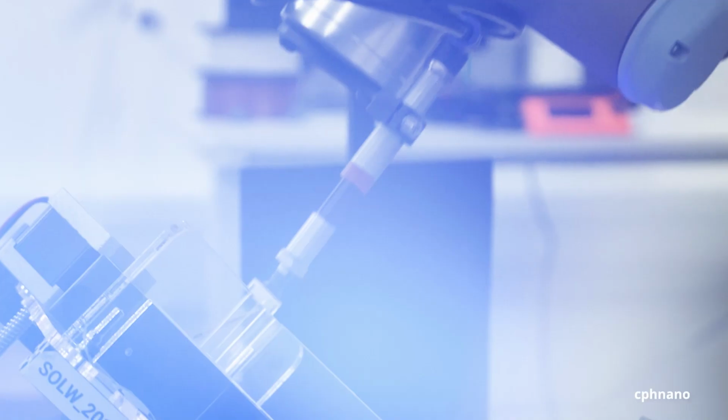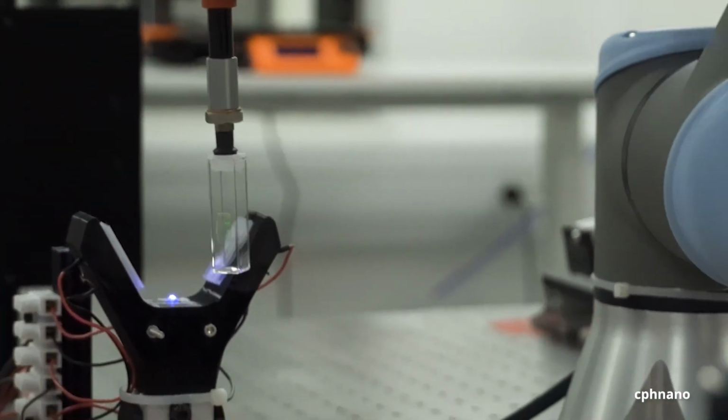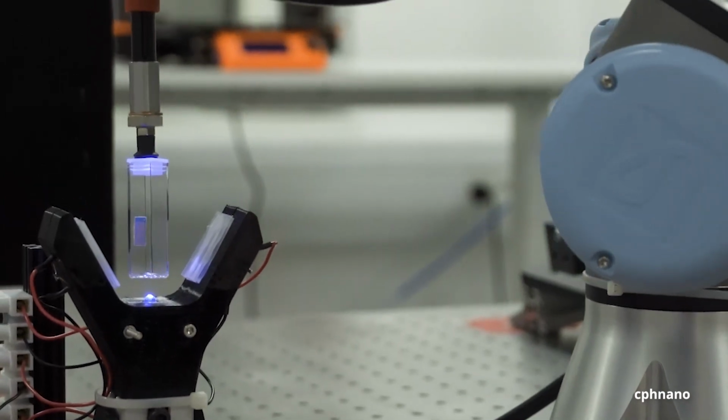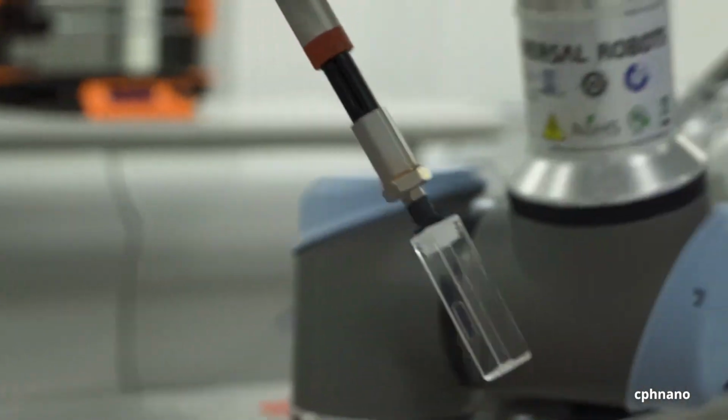One of the first instruments that you're helping to transform and bring into the digital world is the spectrophotometer, because there's over 1 million of them deployed globally. How does the platform for cphnano bring the spectrophotometer into the digital age? Normally when you have a spectrophotometer, you are measuring the intensity of light and how that is lost over the duration of the sample. So you put your light through the sample, and then you measure the intensity loss. And this is a method that was actually pioneered during the Second World War, mainly for DNA research. This is the historical foundation.